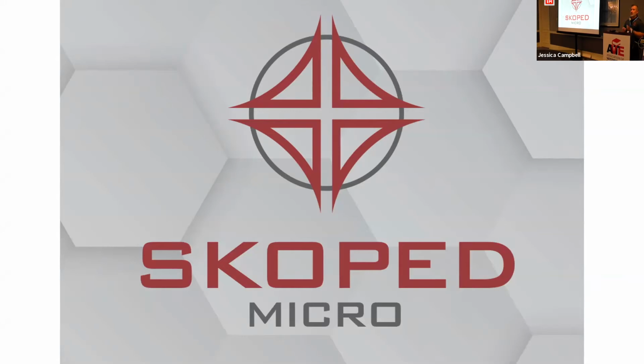And then it started rolling down this high hill. I started noticing that I'd have a technician that might miss something on a slide. Instead of she and I looking through the eyepieces, and I would say, see the purple thing up to the right? And there were a lot of purple things. And they'd say yes, and I never really knew if that were true. Well, now I just pull my phone out, we put it on there, and now I had a little viewer, and I knew I was doing a better job educating my staff.